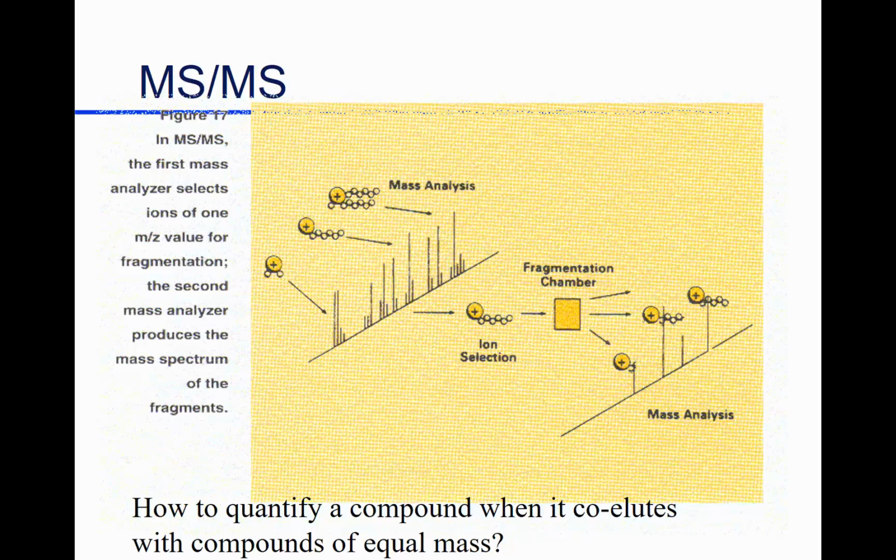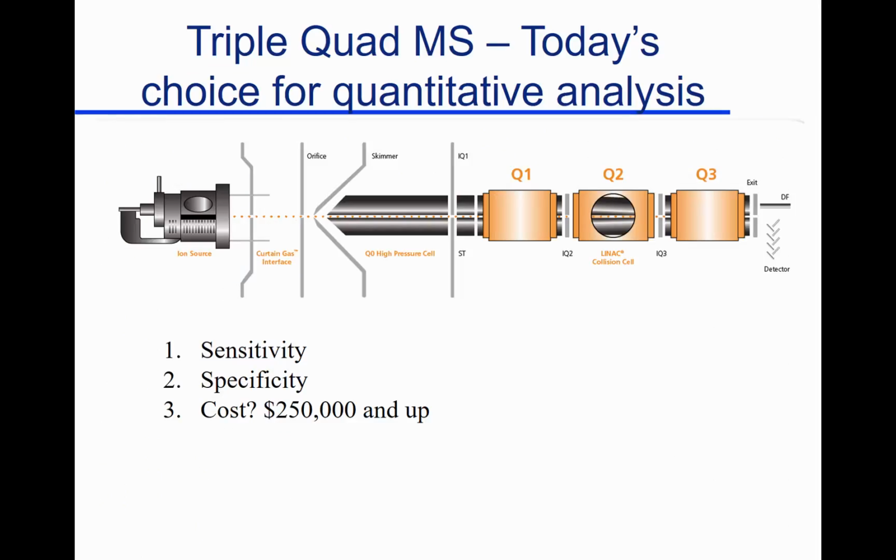So what I do is focus on this, so this particular fragment gets bombarded again and broken down to see what it is. You can get a whole bunch of spectra, and you can start taking apart each one of those pieces and make sure each piece is correct. It's a tremendously powerful tool in many different ways.